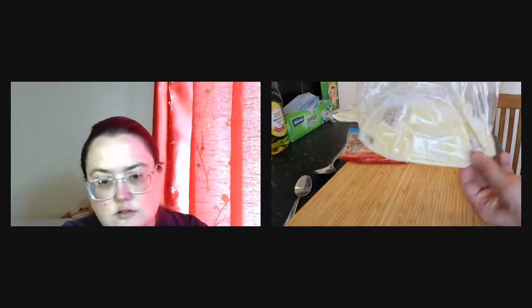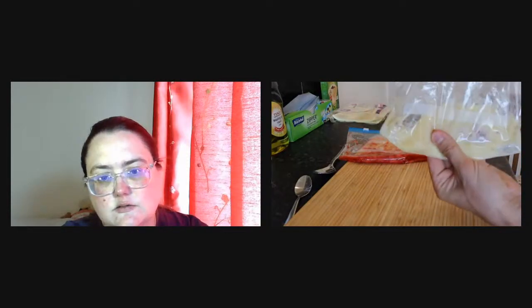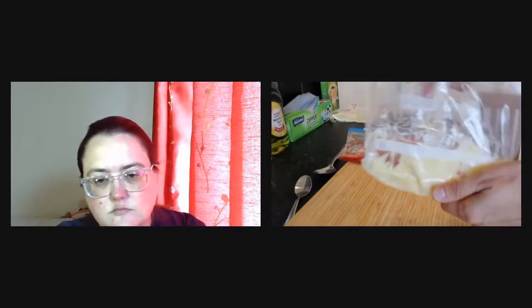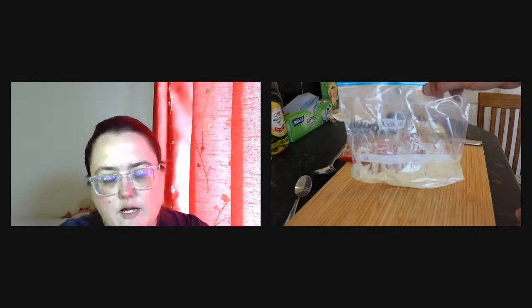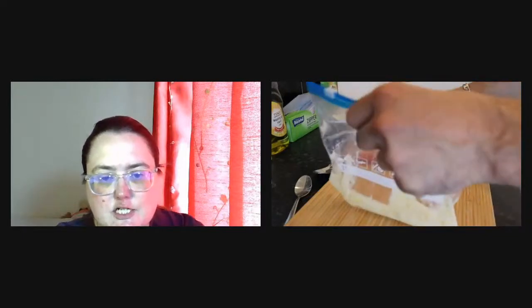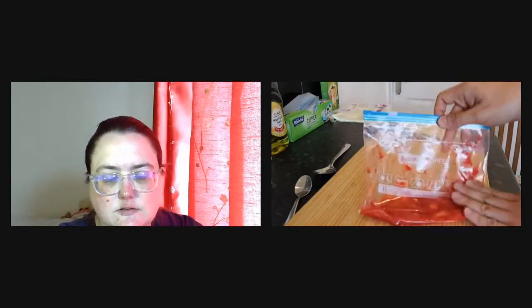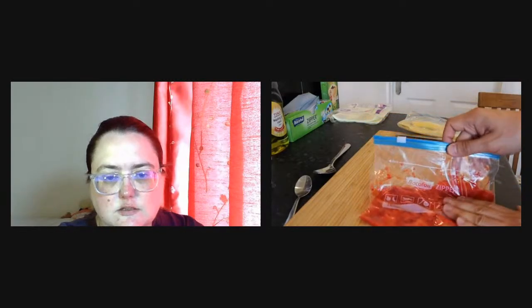It really looks like a puree, like a potato puree for the banana. So we really want something which is very homogeneous. So it's all, what would be the word? All the same, all together, anywhere, everywhere? Yeah, all the same. It looks very much all a mush. It doesn't look like there's any chunks in there at all. I'm going to try again a little bit more for the strawberries to see if I can have them a little bit better.